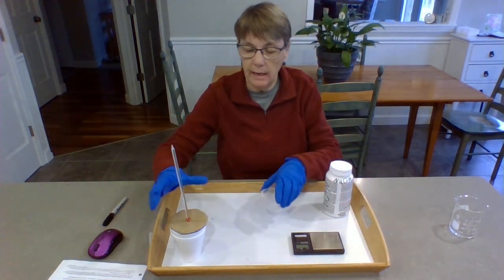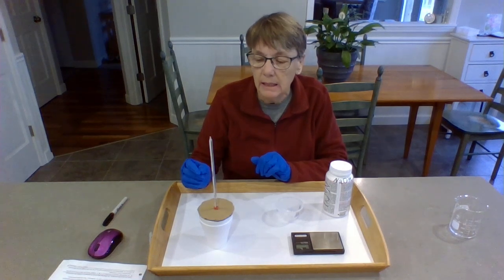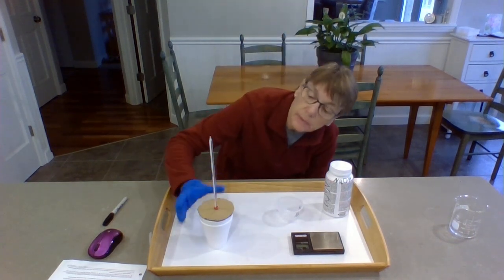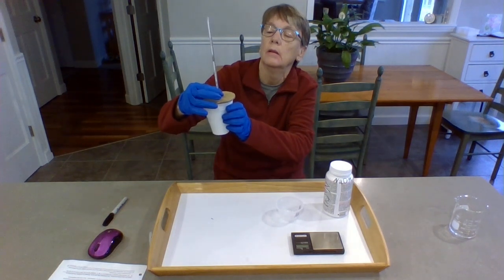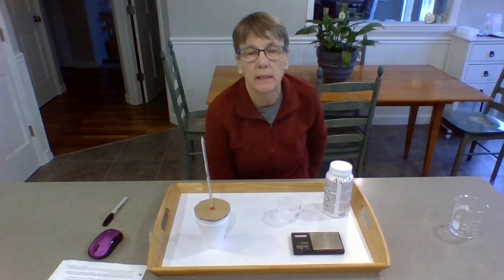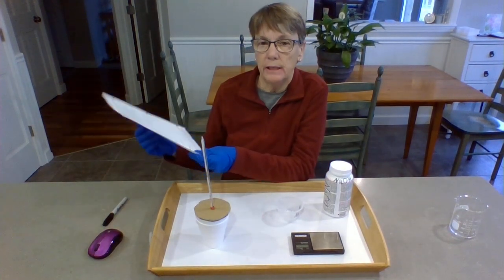Okay, so now what I'm going to do is take my reading of my vinegar in my calorimeter. The temperature reading that I'm going to take is going to be the initial temperature of both the vinegar and the calorimeter. And it is reading about 19.8 degrees Celsius. That's going to be step 8. That's your initial temperature.